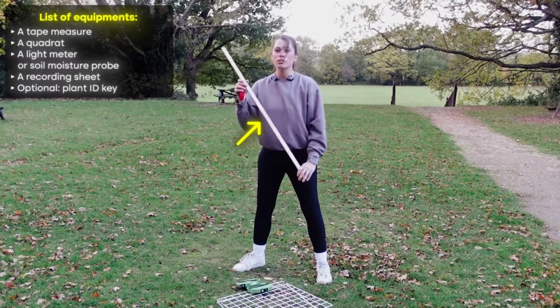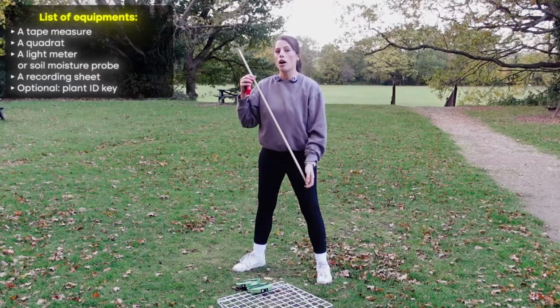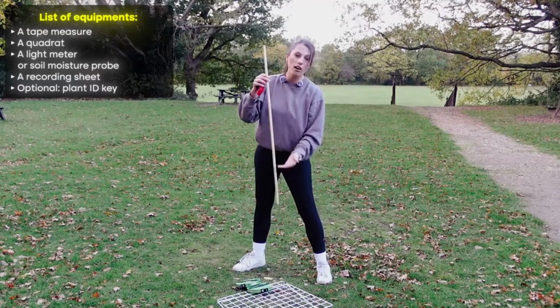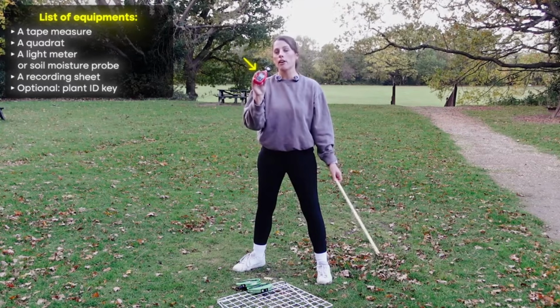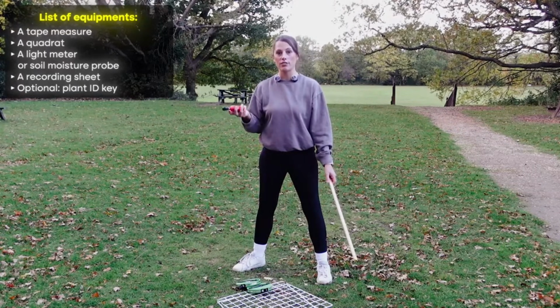I've got a meter ruler here, but I don't think I'm actually going to use that for what I'm doing. But if you were going to be measuring, let's say, the height of plants or something, then you could use a meter ruler. And also I've got a light meter so that I can measure the light intensity in the different areas.